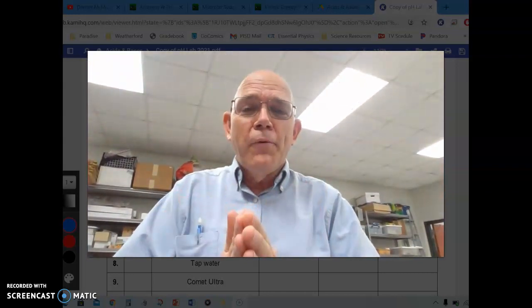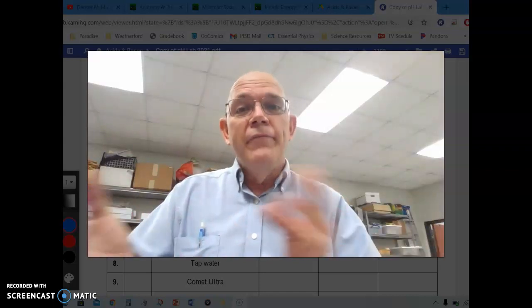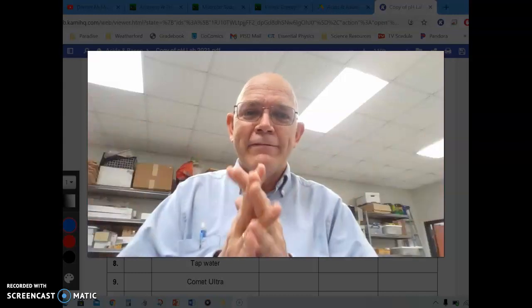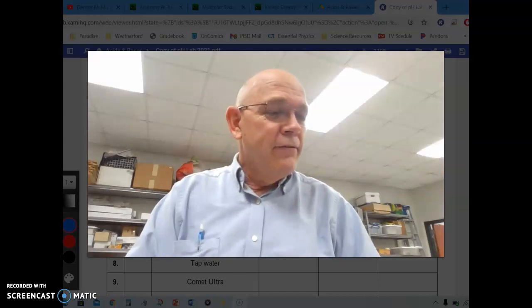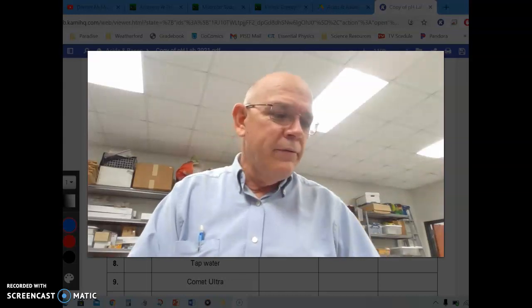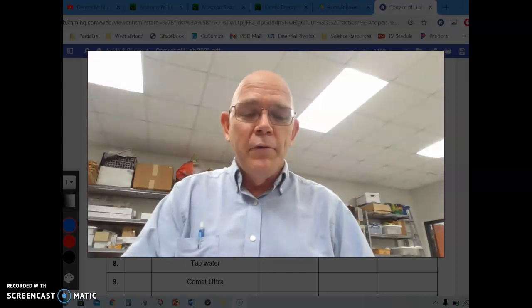Anyhow, so for physics today, we're going to do a pH lab. Actually, we did it yesterday, or started it and finished it up today. But since I know I had anyone in IPC that was online, we didn't do that. But we are ready to go now. If you were here, you'd be wearing an apron, and if I were not the teacher, I would be wearing an apron. But I'm not. We're going to do a pH lab.